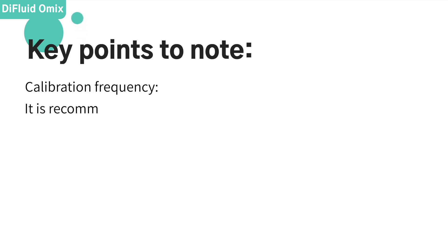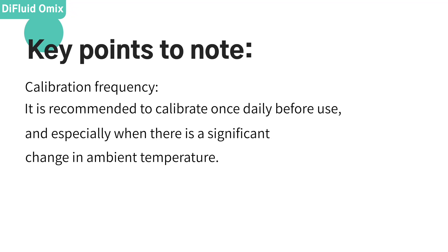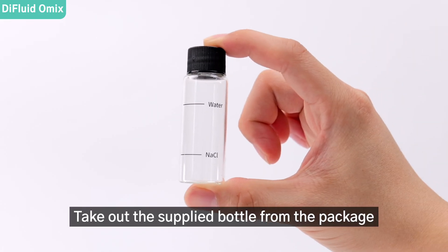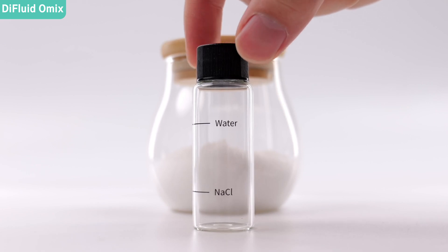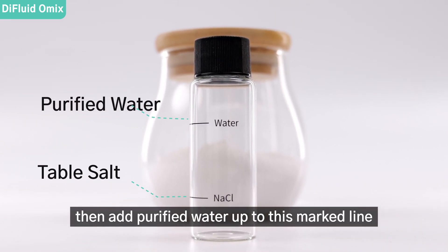Calibration frequency: it is recommended to calibrate once daily before use, and especially when there is a significant change in ambient temperature. Take out the supplied bottle from the package and add regular table salt up to the marked line, then add purified water up to the marked line.